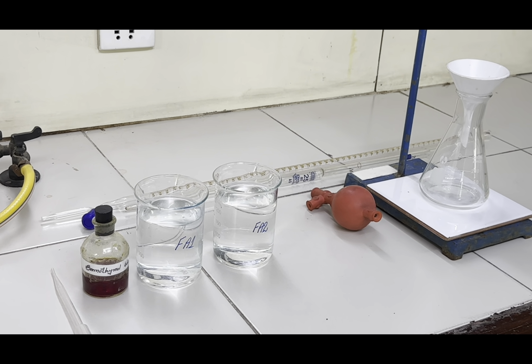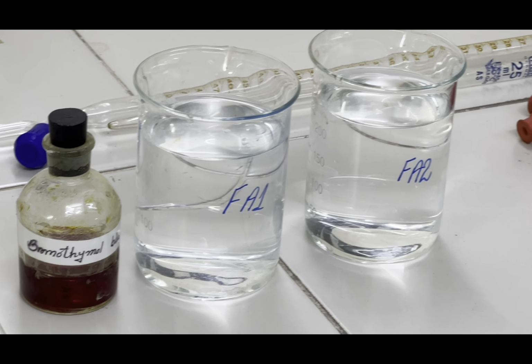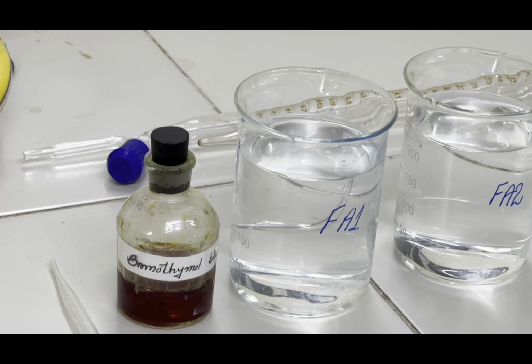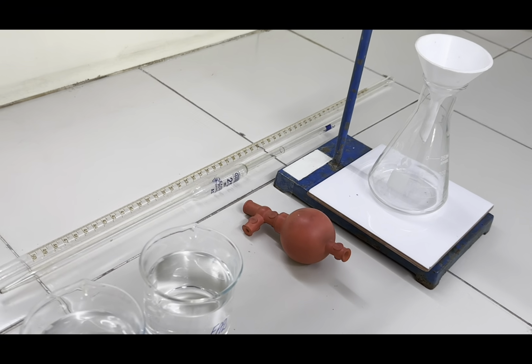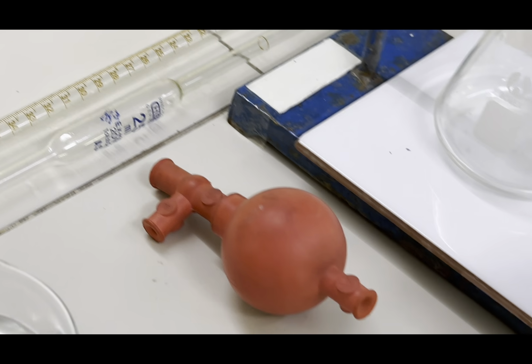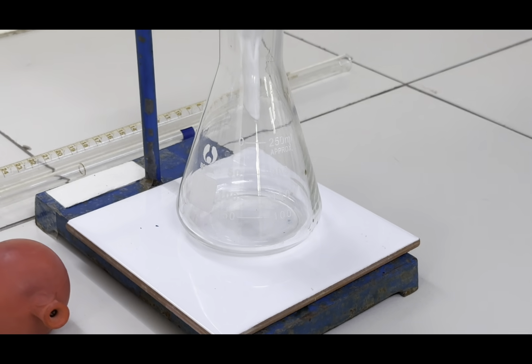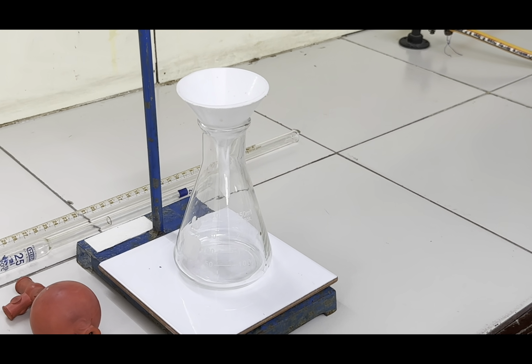Reagents and apparatus given for this experiment are FA1 solution, FA2 solution, bromothymol blue as indicator with a dropping pipette. Then we have a burette and a pipette of volume 25 centimeter cube with a pipette filler. Then we have a retort stand here with a white tile and a conical flask with a funnel.